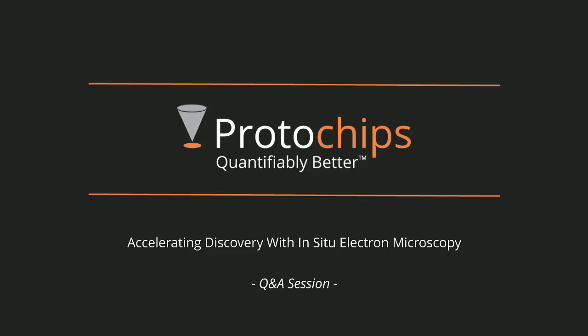Okay. Next question here is again for Jordan. Please believe me, you can go ahead and ask great questions. We're happy to have questions for both presenters. So someone has asked, has anyone used the fusion holder to simultaneously heat to a high temperature and also apply bias at the same time?